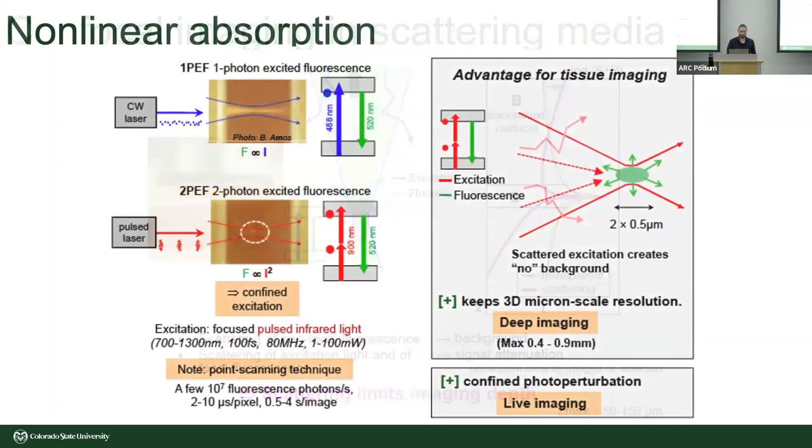you lose spatial resolution. So contrast this to the case with nonlinear absorption. And again, we've seen images like this already. It's a rite of passage in every multiphoton microscopy lab to take a photo like this. So there's an abundance of them online to be able to throw into a talk. The illumination light forms fluorescence excitation throughout the entire cuvette. In the two photon case, because it's only in this region, we no longer need the confocal pinhole. What that means is we can remove that spatial filtering from the system and any photon, regardless of how much the fluorescence light has scattered, we know it had to originate at the focal spot.